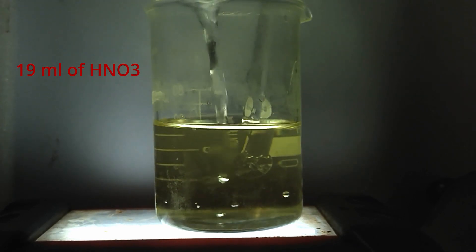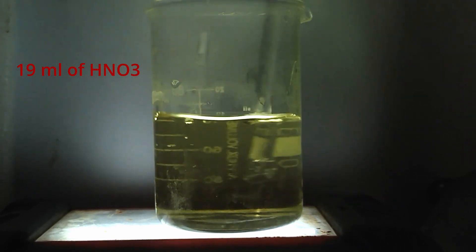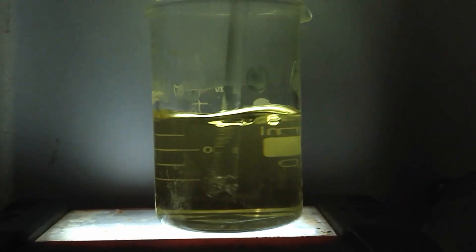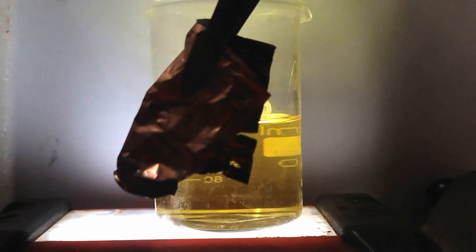And as expected, the solution turns yellow, an indication of its extreme reactivity. The mixture is strong enough to dissolve gold and platinum. But since I am too rich, I will use a copper foil instead.